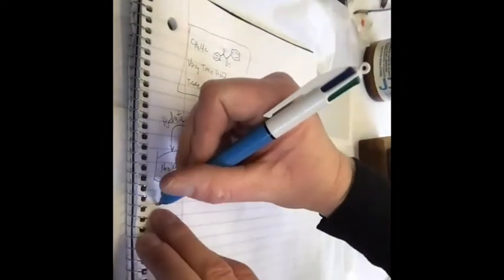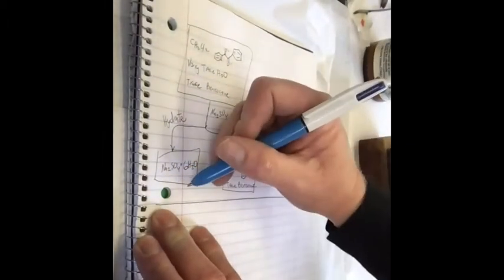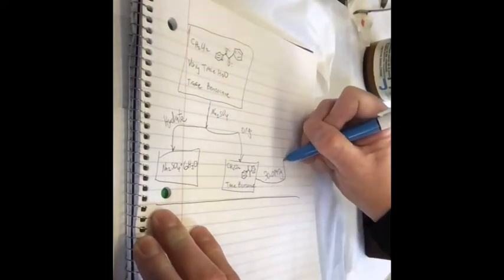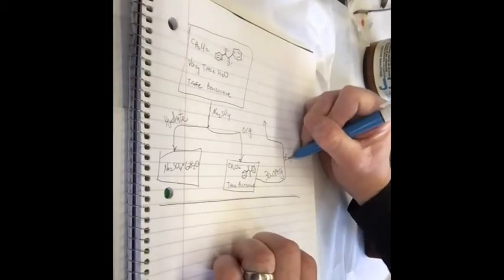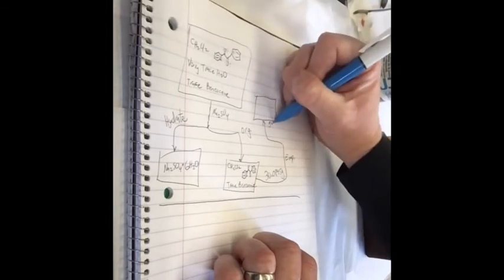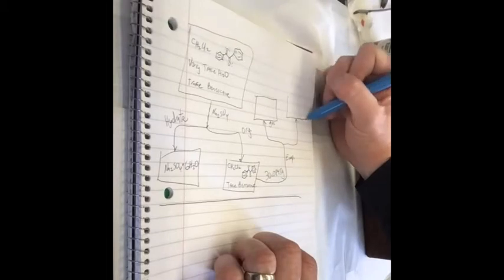Okay, so our organic layer, we're just waiting for it to evaporate. This is, let's say, this guy. Let it evaporate. And then you have a gas over here. What's the gas that's evaporating away? Methylene chloride.